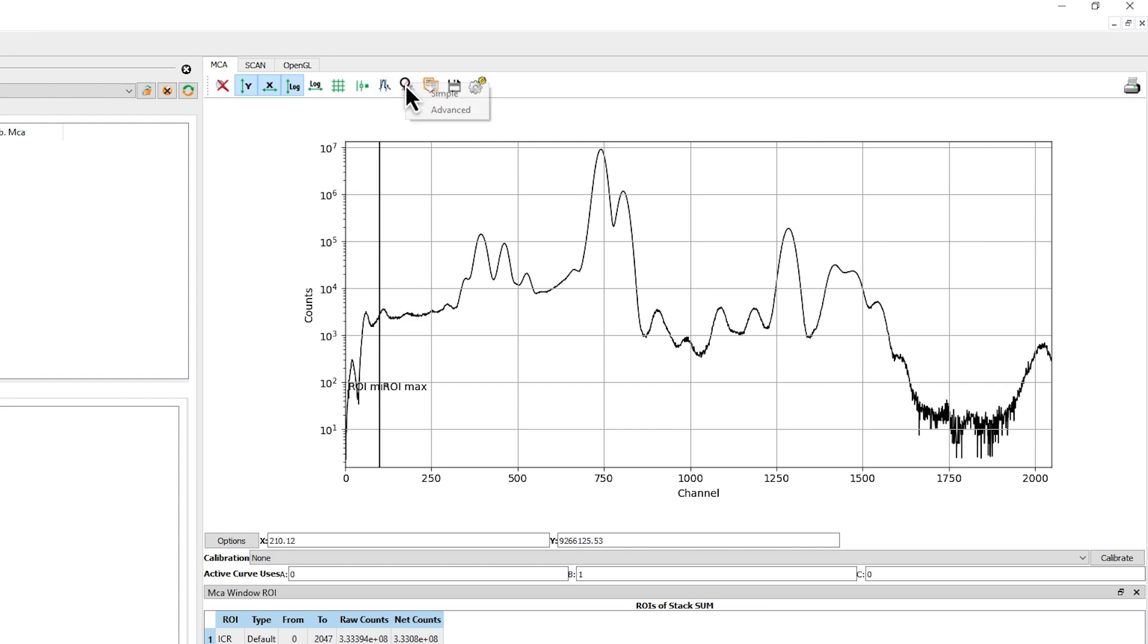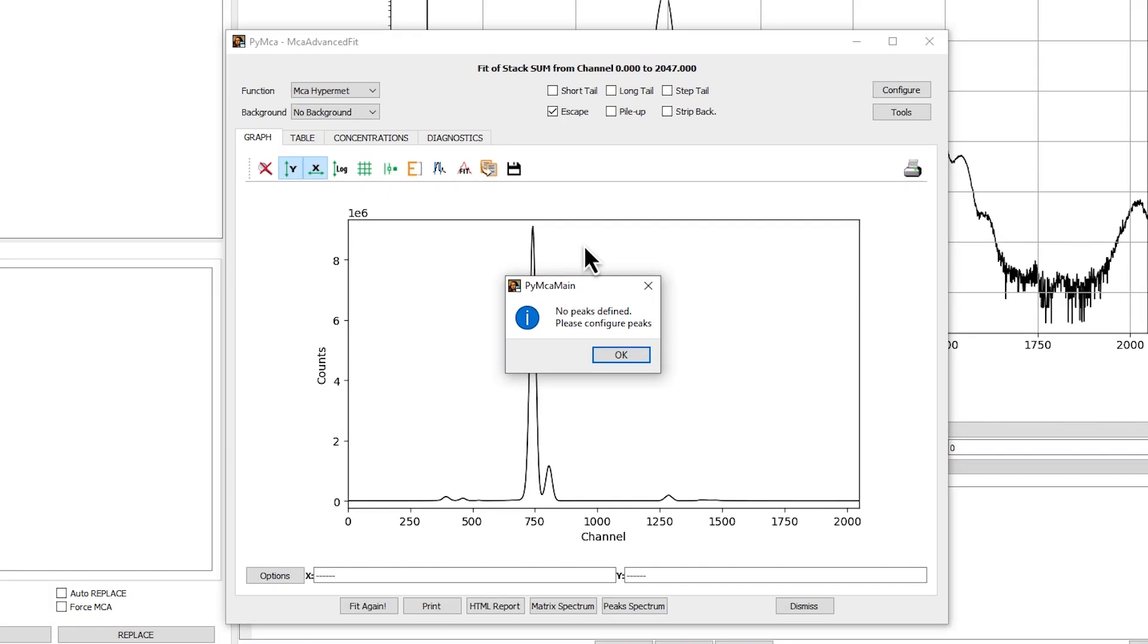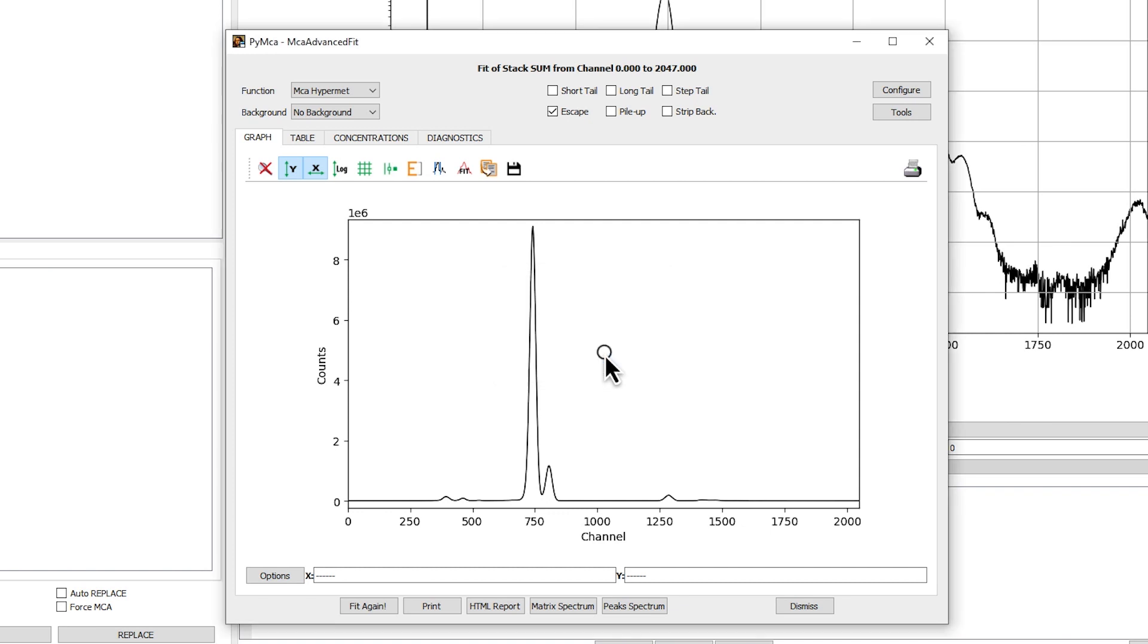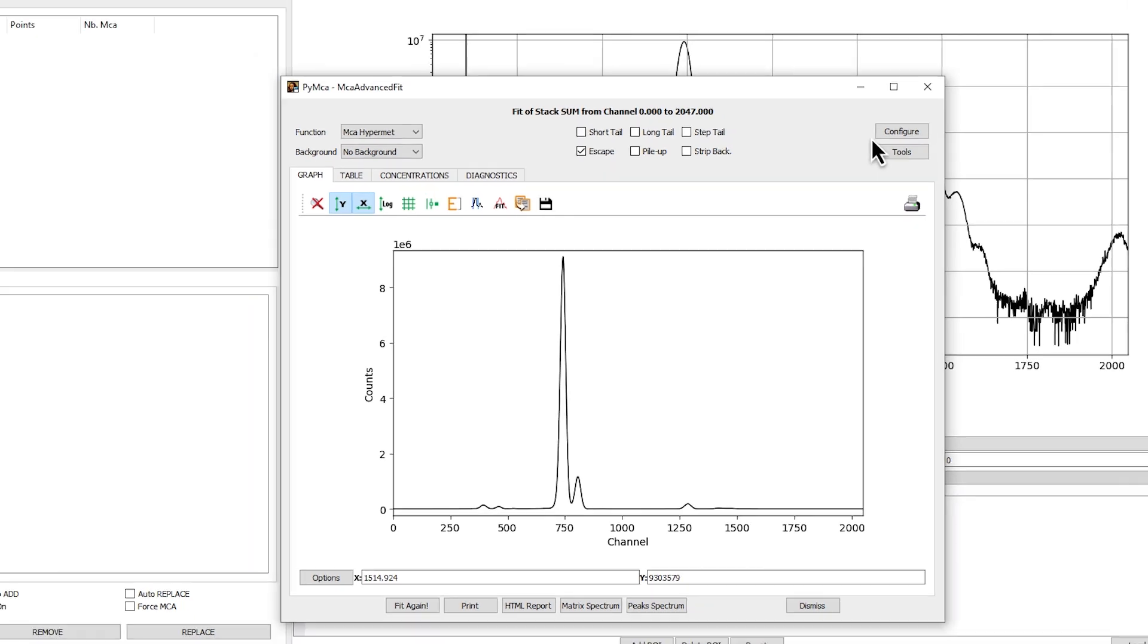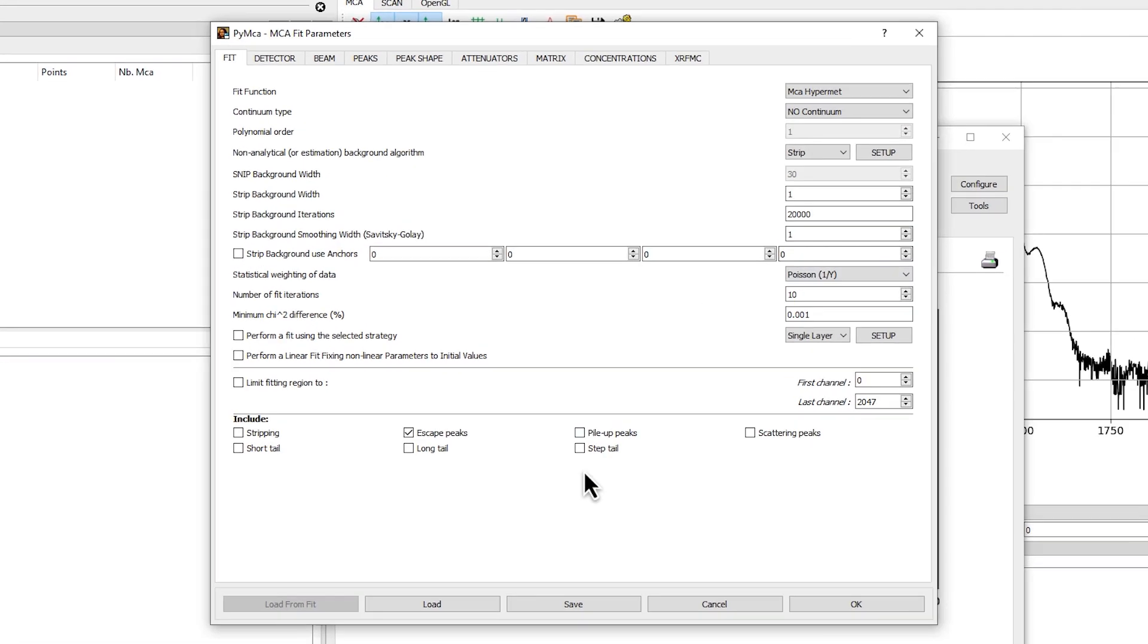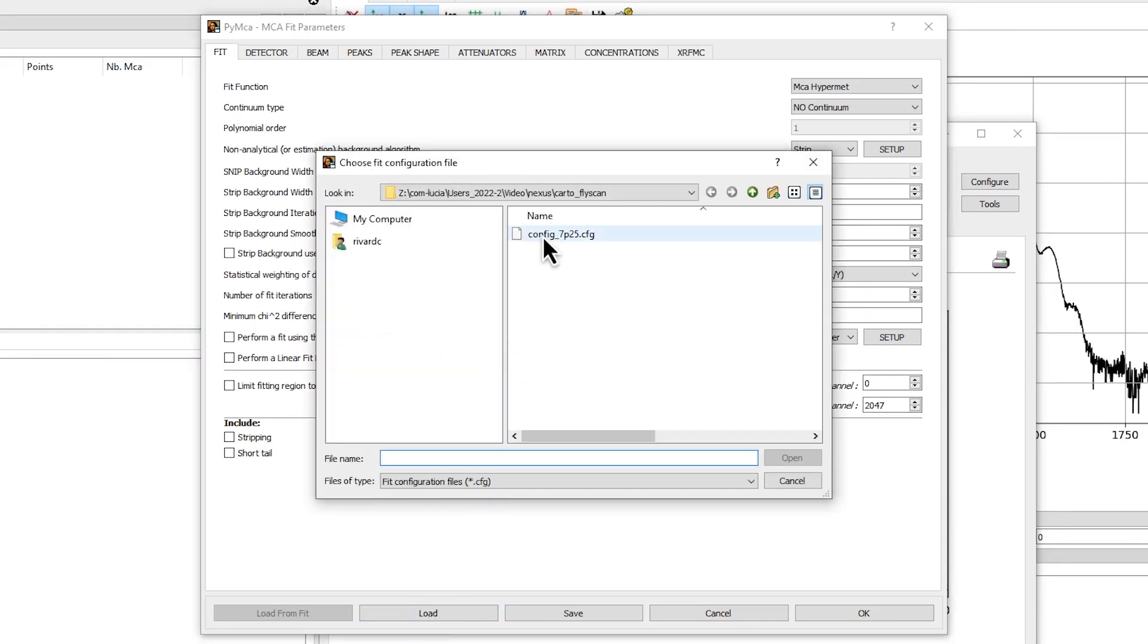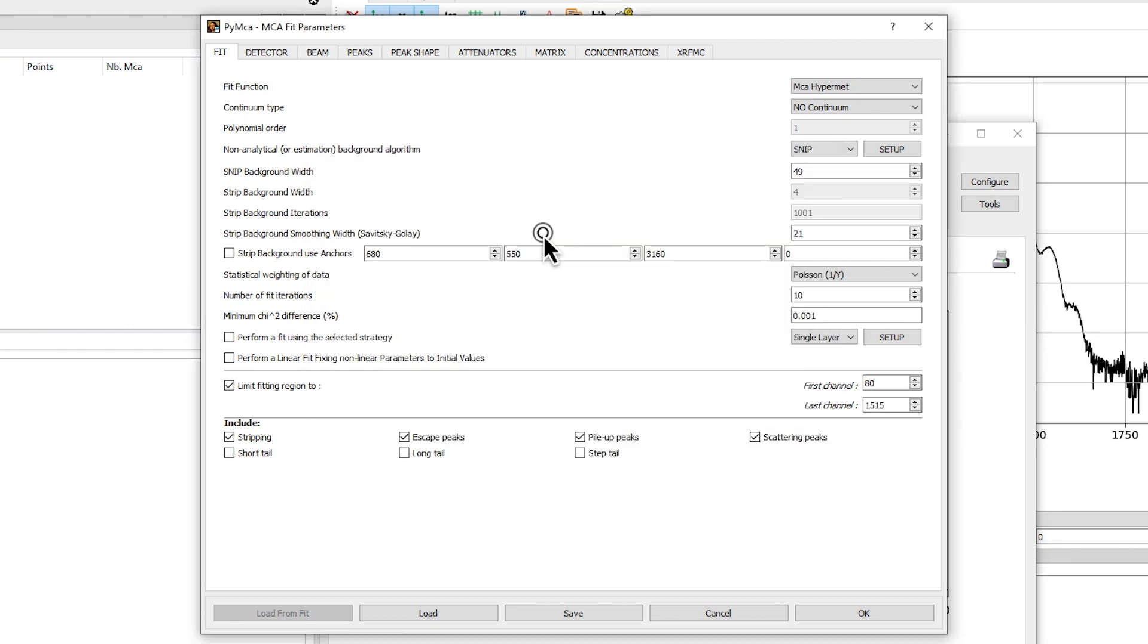Click on Fit icon then Advanced to open the MCA advanced fit window. If present, accept the message indicating the absence of defined peaks. Click on Configure to open the MCA fit parameters window. Click on Load to open Lucia configuration file. With the help of your local contact, check and modify the excitation energy, the energy range of the fit, and add or delete elements until you obtain a satisfying fit.